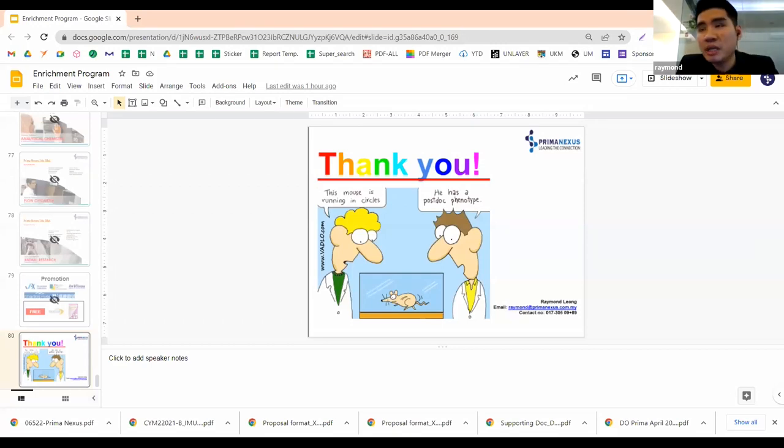Holding room. Okay, meaning that in our animal house, most of the animal houses, I would say, will have a 12 hours light and 12 hours night cycle. So meaning that they will have 12 hours of light on, another 12 hours of light off cycle most of the time.